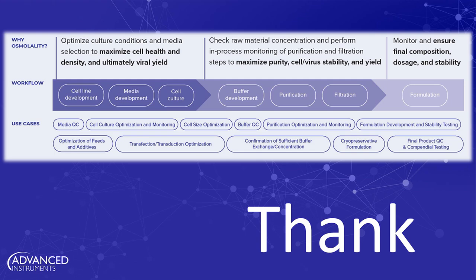All right, so I want to just wrap up really quickly with an overview of what we've seen. And you can see that just as I broke down today's presentation into upstream, downstream, formulation, final product, this really gives a nice bird's eye view of how widespread the use of osmolality testing could be within the cell and gene therapy space. So we're excited to develop some of these ideas more and to learn how you are or will be using these in the future. So again, please let us know what you think.